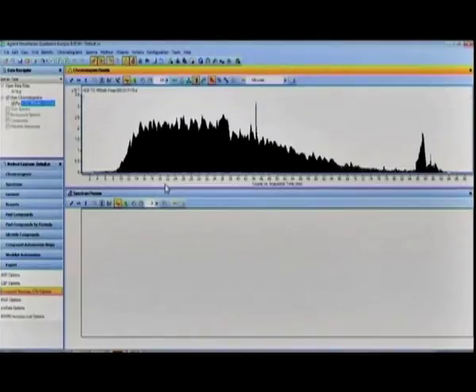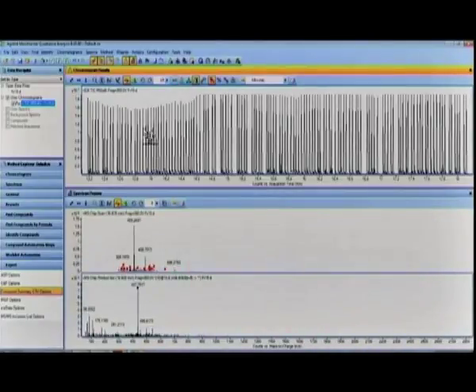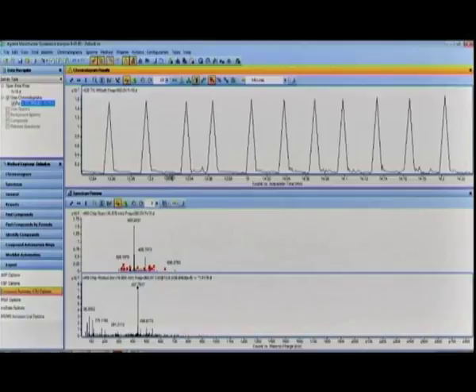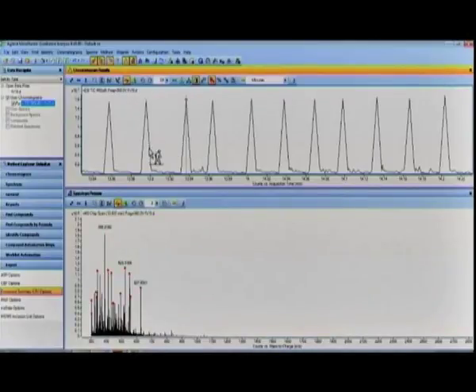The chromatogram shows the acquisition time period on the x axis and the intensity of the eluted peptide ions on the y axis. Use right click of the mouse to zoom in on the chromatogram. The bigger peaks which we can see are MS spectra. At the bottom of this window, we can see another window which shows different spectral peaks representing the precursor ions with red color annotation on top of each peak.